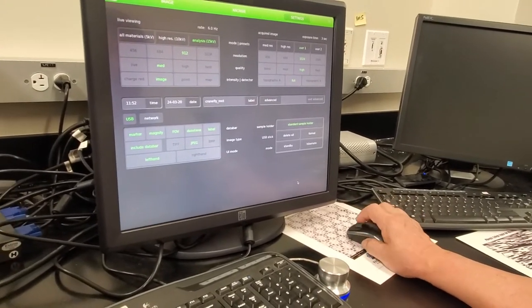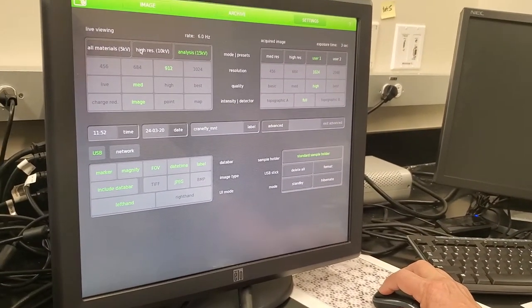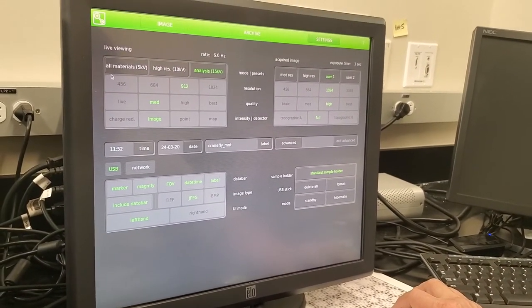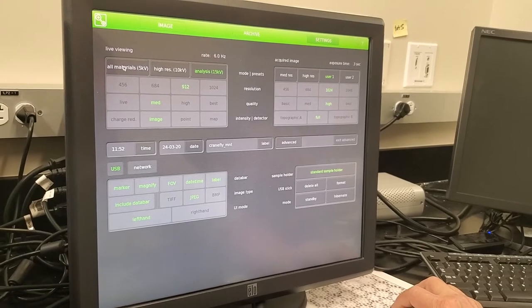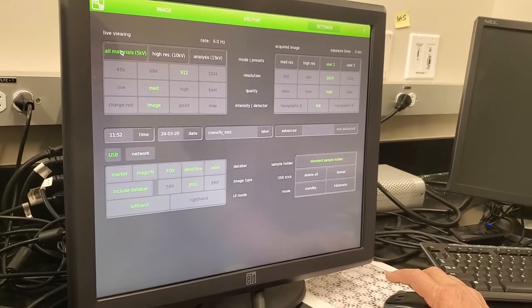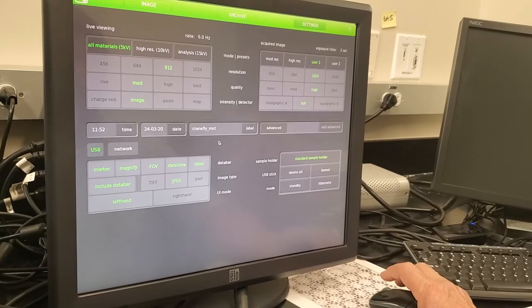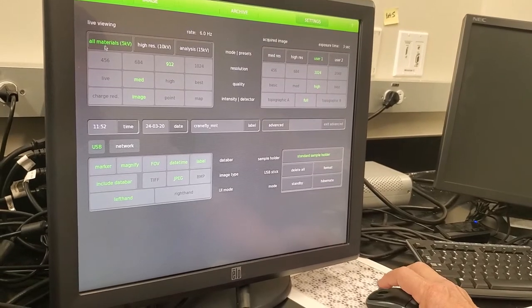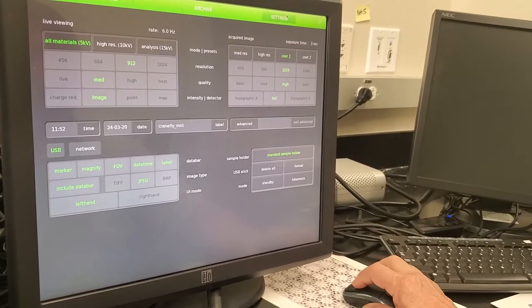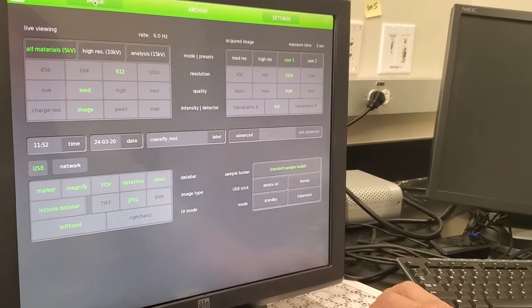Now, next thing — I want to get into high resolution, but actually I'm going to do All Materials first because I don't want to burn the sample. So it goes like that. Therefore, crane fly is set at 5,000 volts. Now what I'm going to do is go back to Image.